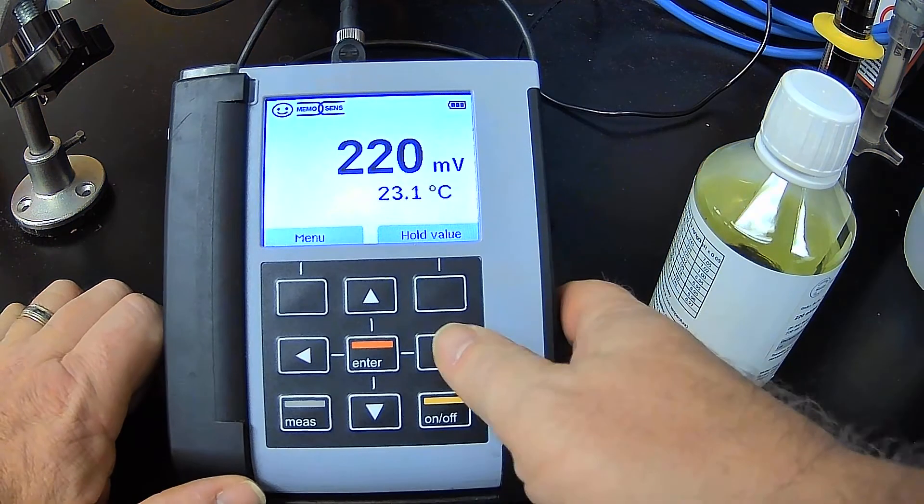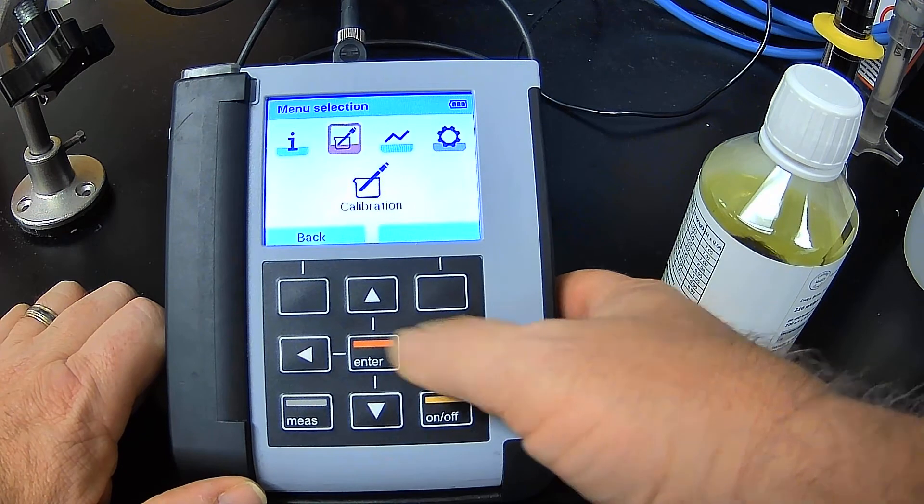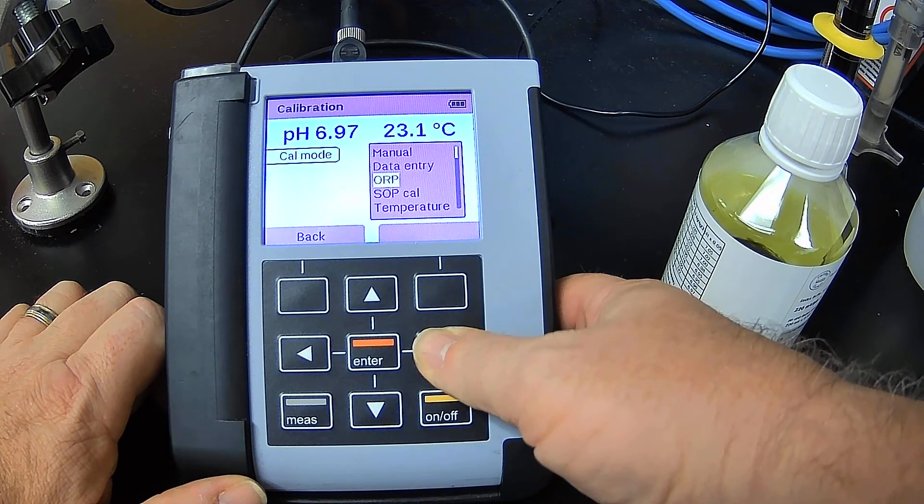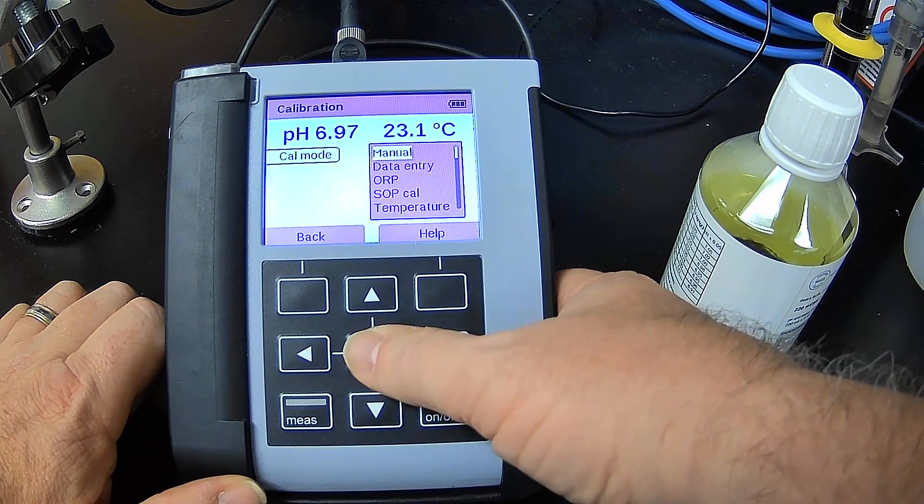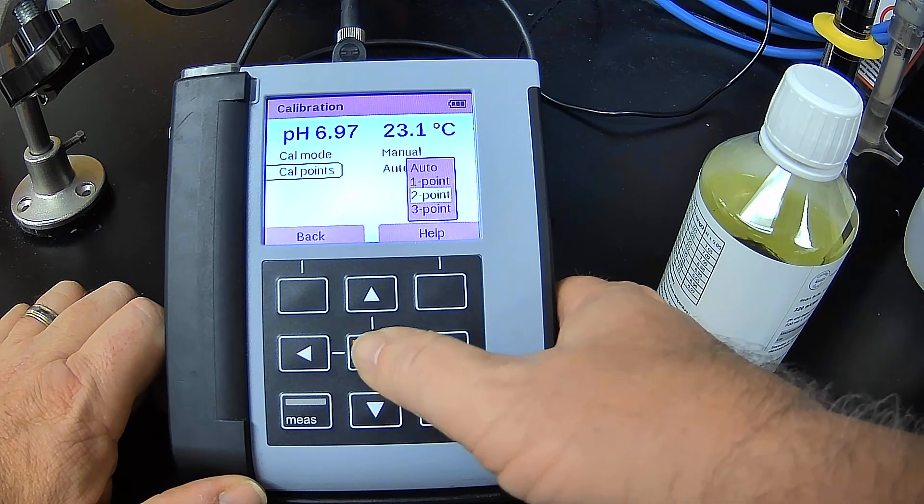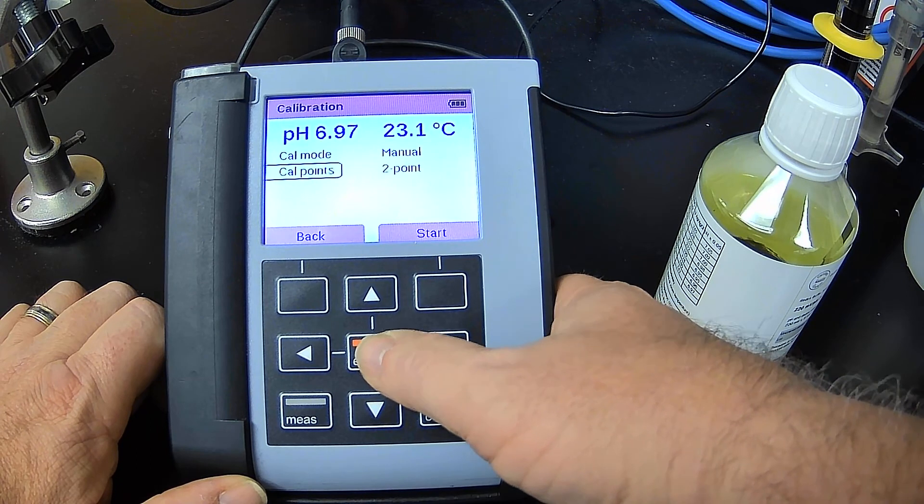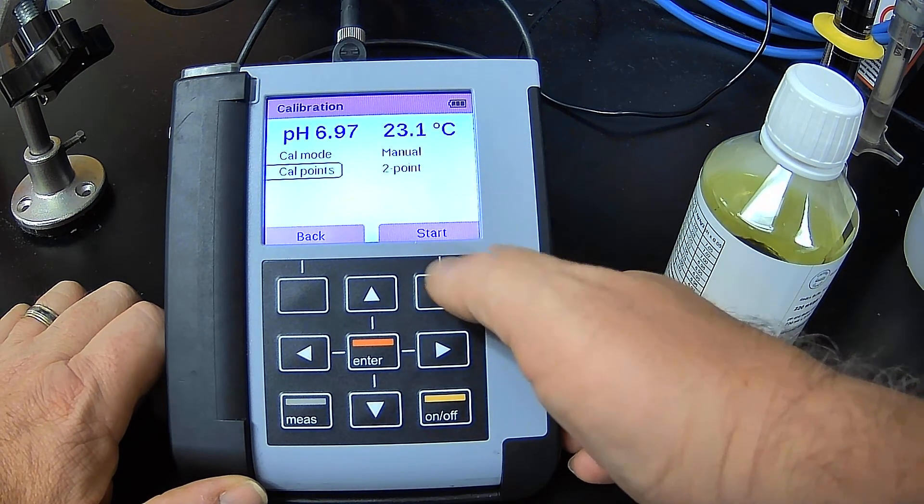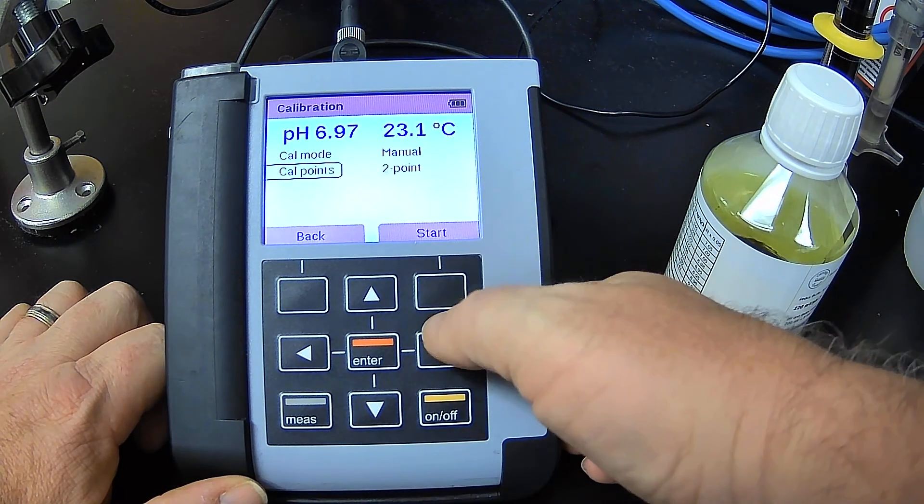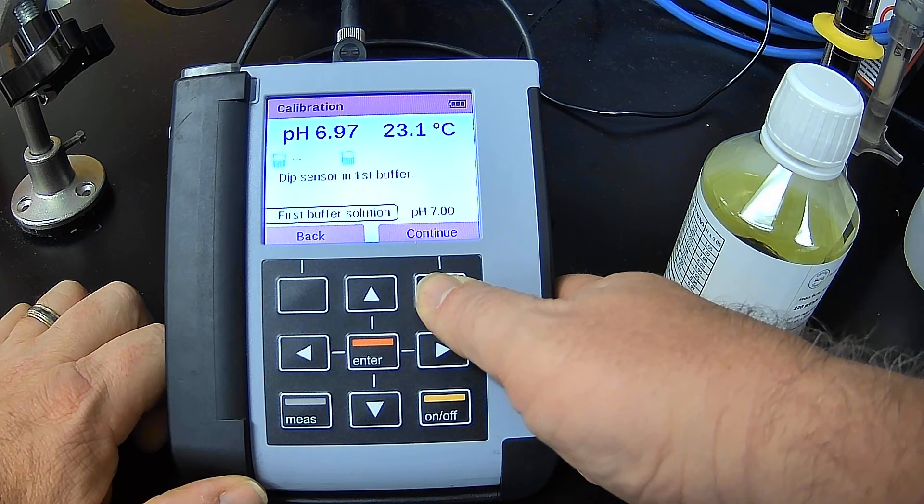So now I'm going to hit menu, calibration. I'm going to hit manual. I'm going to do two point calibration. Now I'm going to calibrate the pH side. So again, 23.1. I'm currently reading 6.97, which is pretty close. I hit start.